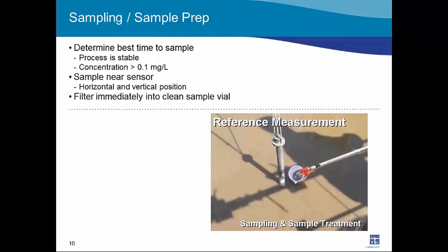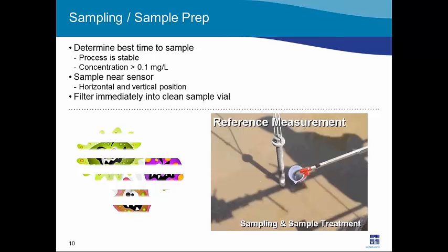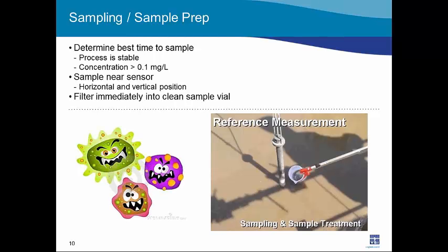This may seem somewhat intuitive, but there are processes, for example, complete mix processes where, in theory, the concentration is not supposed to change. But in reality, there are micro environments out there which could be occurring such that the sensor location is at a much different condition than the effluent.